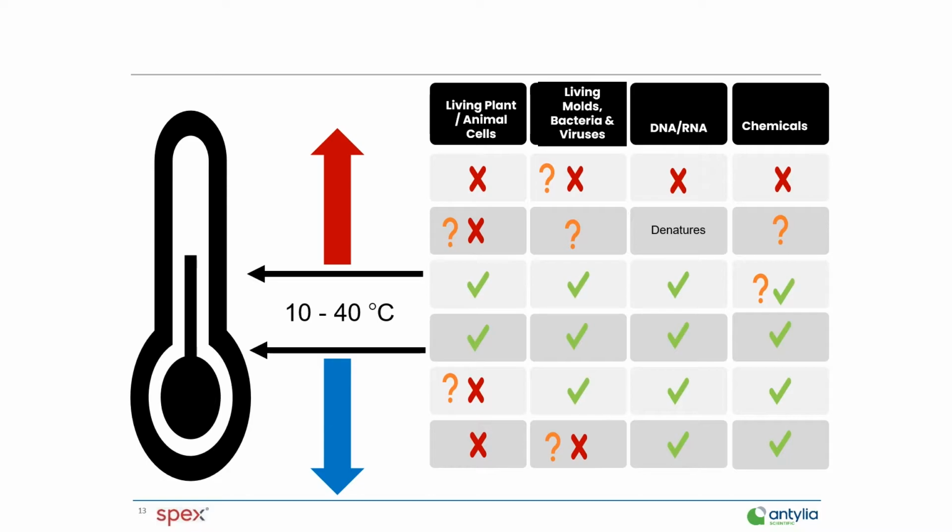It's also kind of similar with chemicals. If you're doing a chemical analysis, you are mostly concerned about not getting the chemical too hot. You don't want it to volatilize. You don't want it to change its structure, but usually colder temperatures are good. And of course, when we use liquid nitrogen, it's all the way down at the bottom of our temperature scale, some of the coldest material. But usually that's a very quick process when you do liquid nitrogen. It's almost an instantaneous freezing process. So that actually cuts down some of the damage across the board because it's an instantaneous freezing.